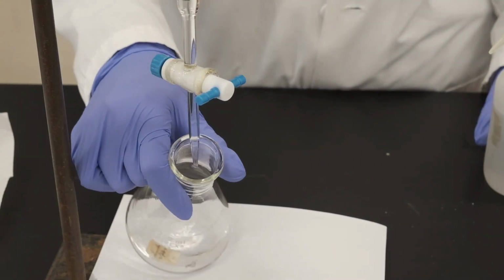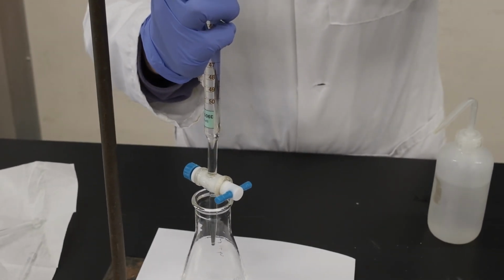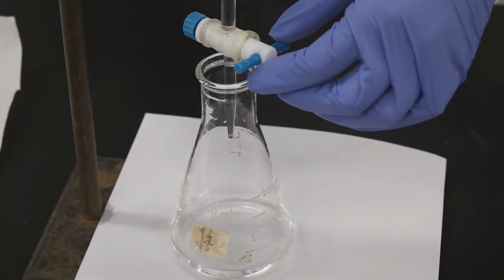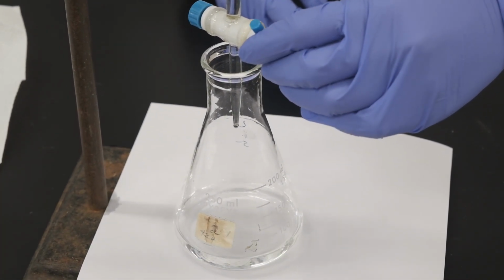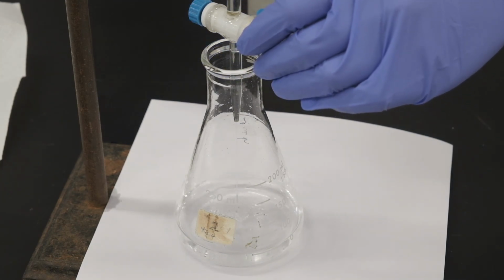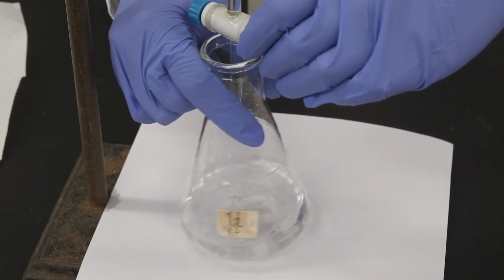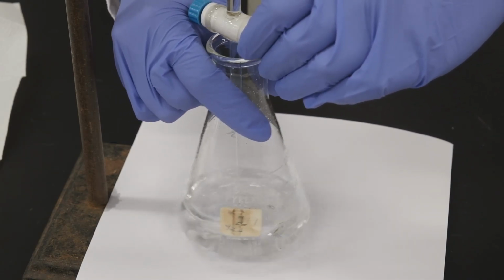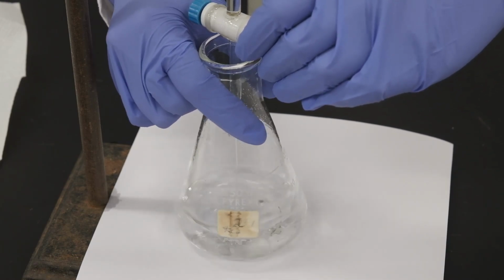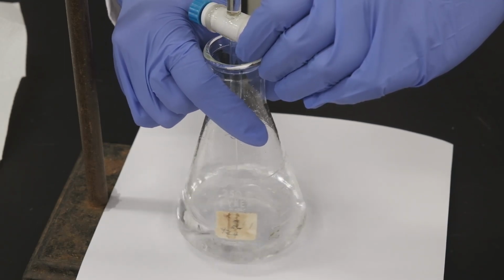To place the Erlenmeyer flask under the burette, we're going to lower it so the tip is inside the Erlenmeyer flask. And then using the knob, we're going to be adding the hydroxide solution. And all the while, we're going to be swishing it. And we're going to continue this until the solution turns faint pink, which indicates that it's reached an equivalence point and the reading will be the end point.